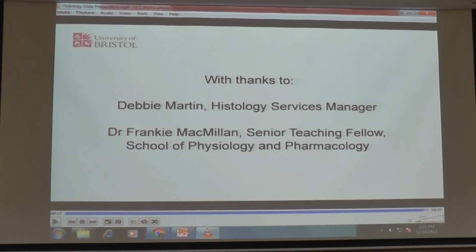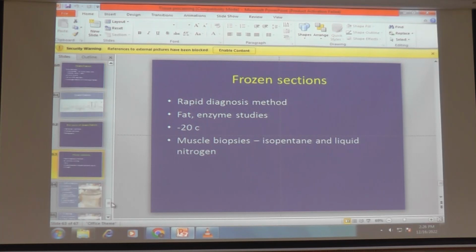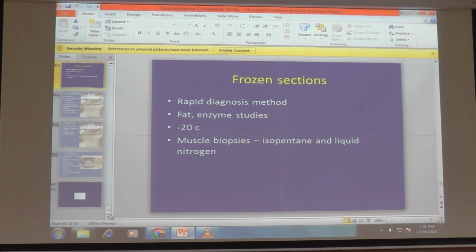There are some other special stains also that we use in histo. If we have any doubt of a fungal organism, then we will ask for PAS or GMS. If we have any doubt about mucin in a malignancy, whether it's a mucin-producing tumor or not, then we will ask for Alcian blue. PAS also stains the mucin. So like this we are using some special stains also.